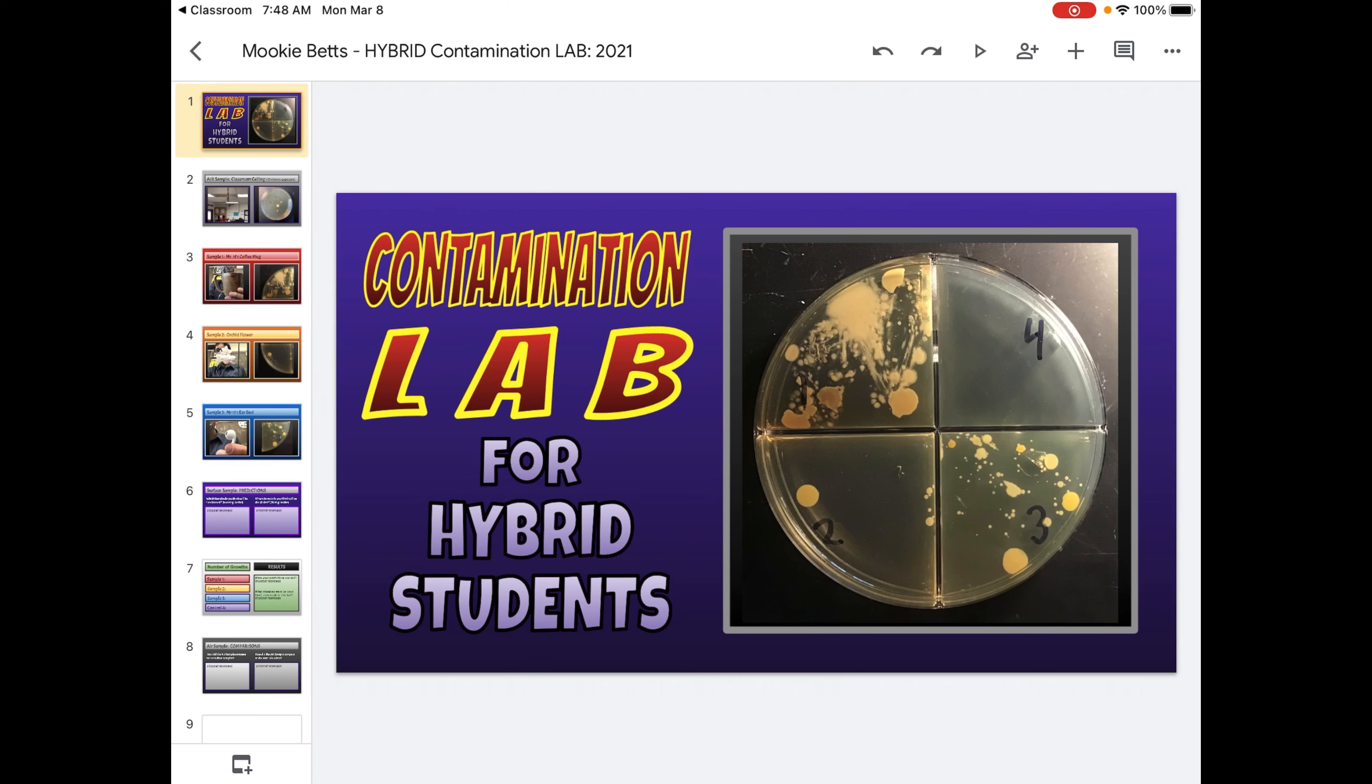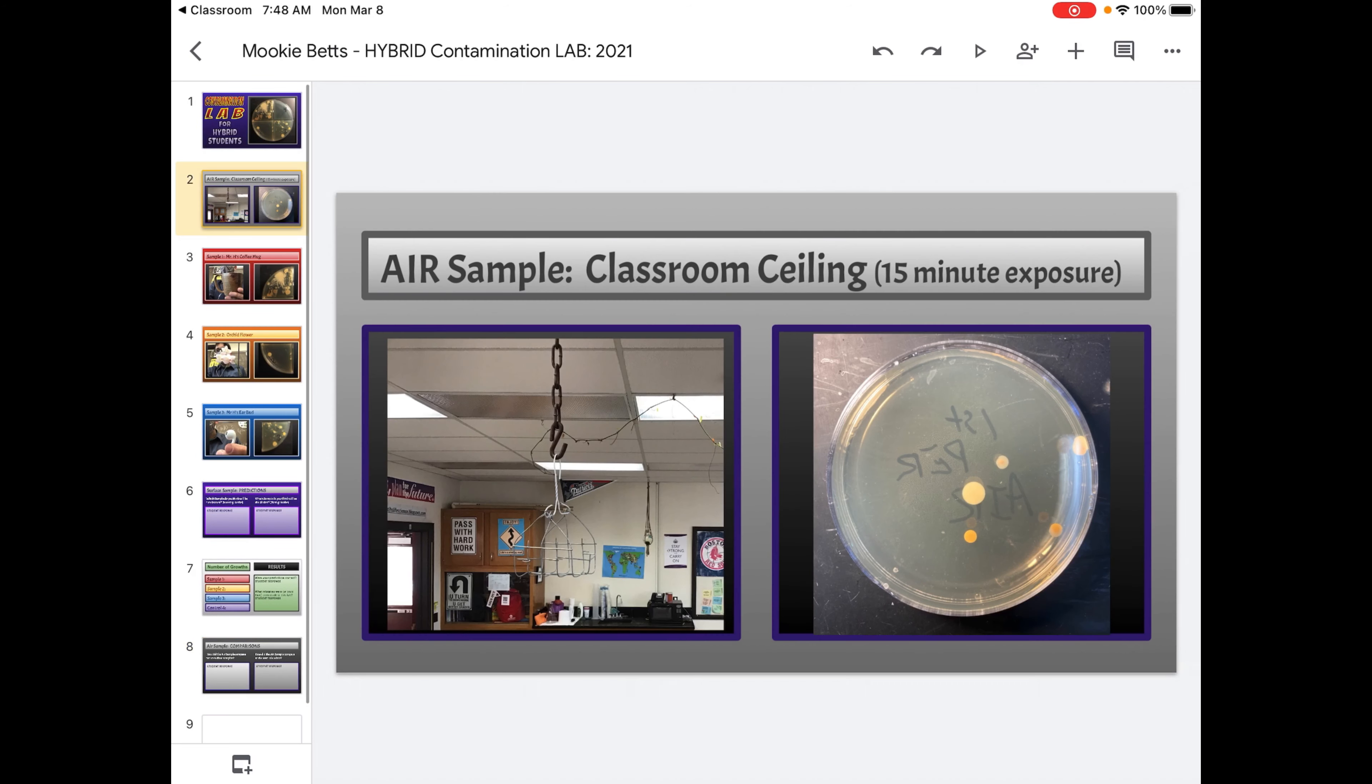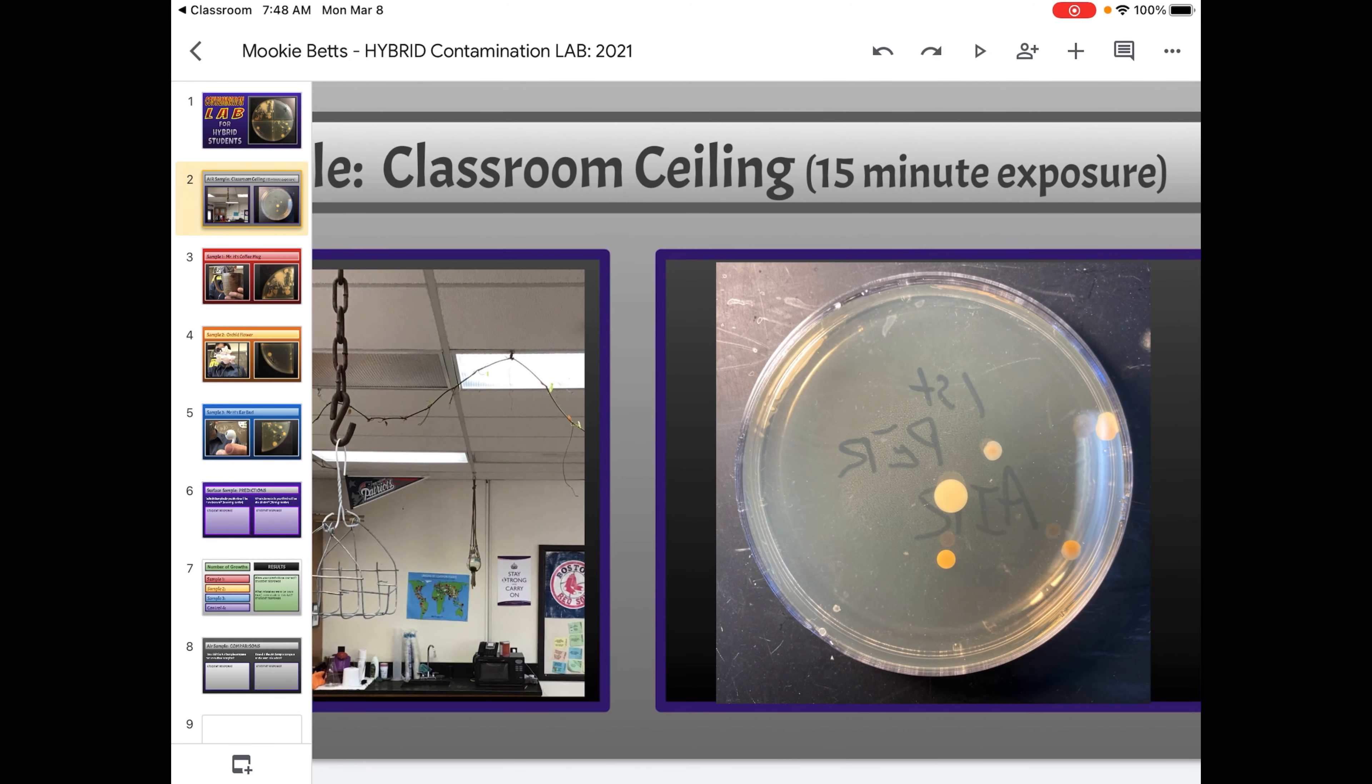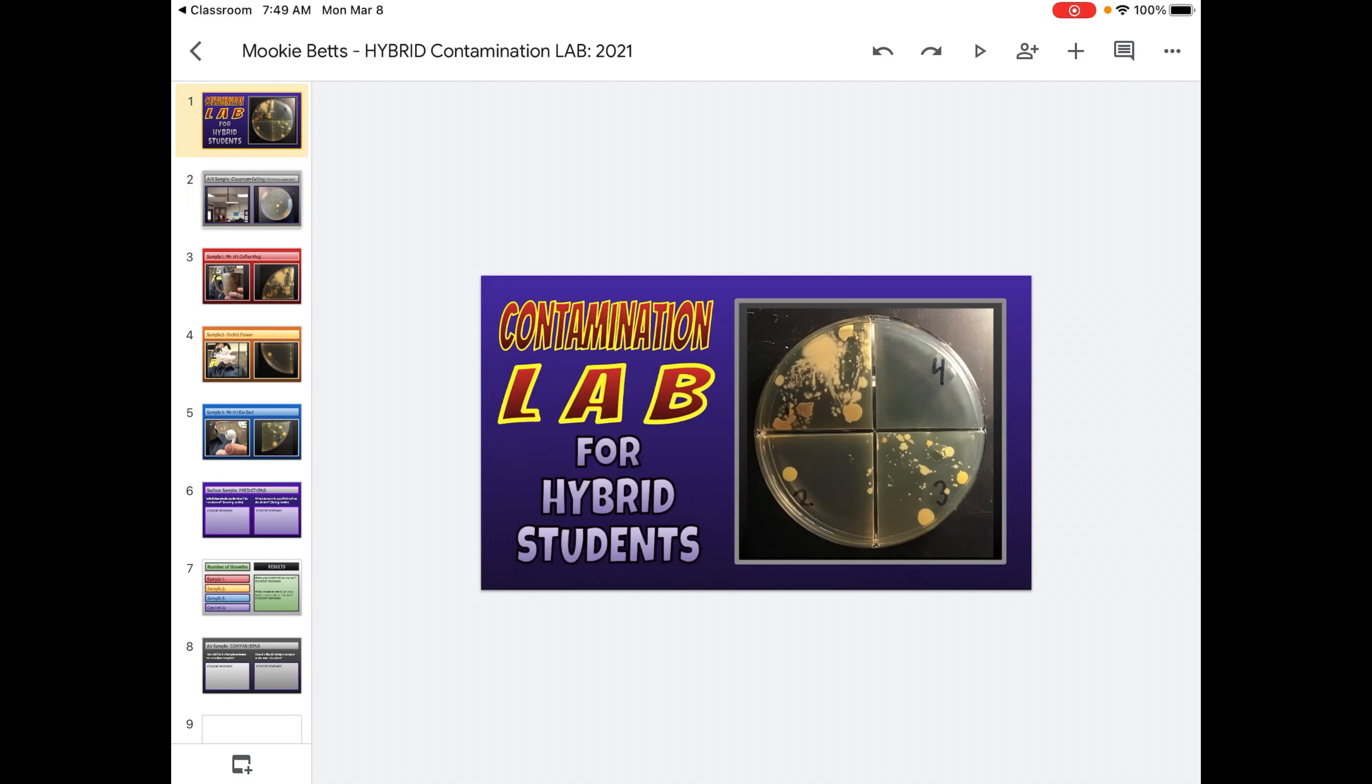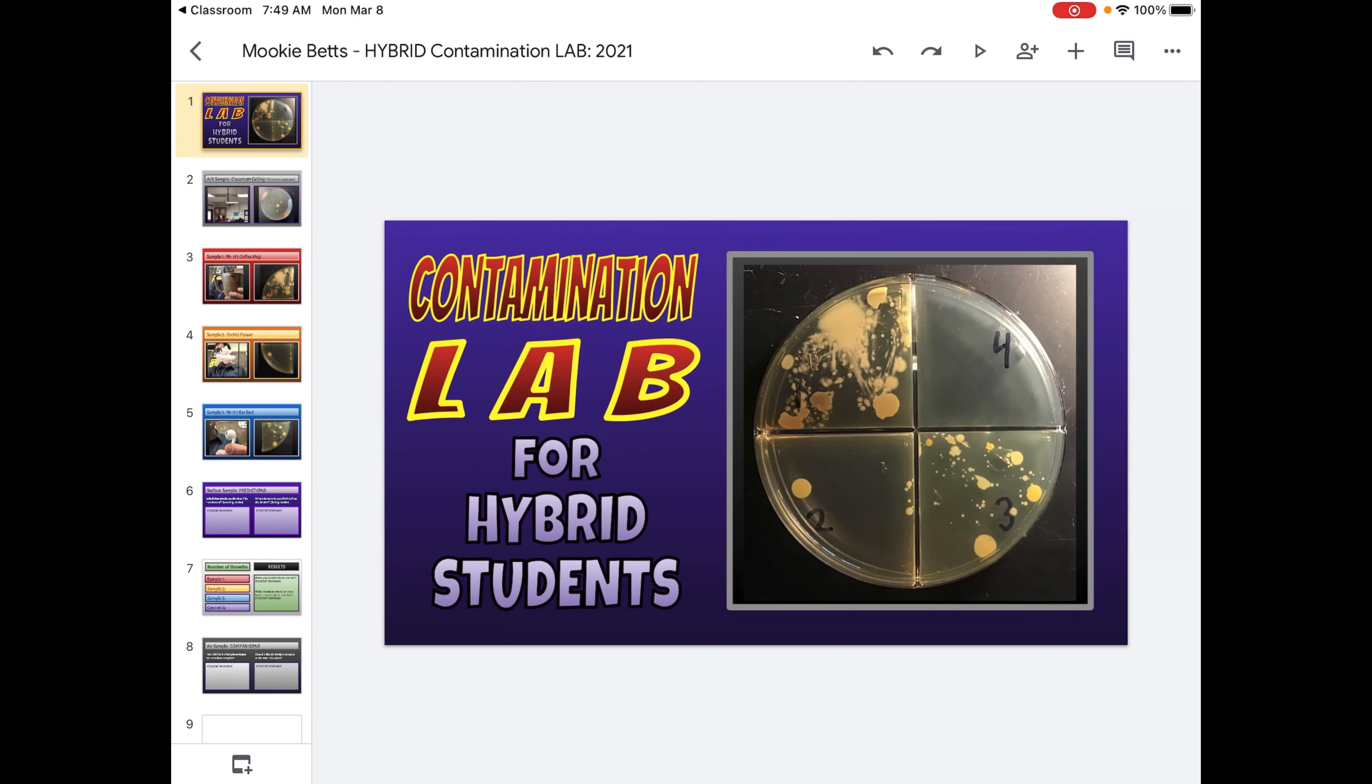If you didn't make mistakes, guess what mistakes others could have made. You're going to compare your air sample to the surface samples and your air sample to the control sample. And so here we have the air sample. So if I compare the air sample to the surface samples, I can say some things about it. And if I compare it to the control, the control again is this one. A lot going on there.